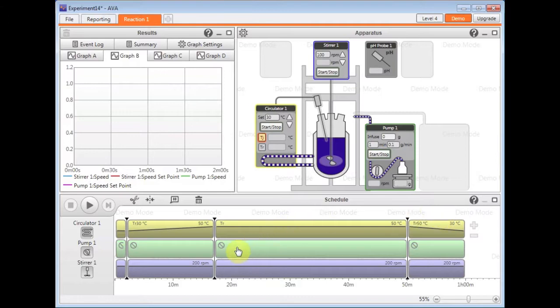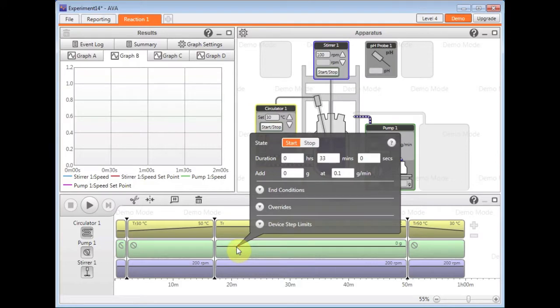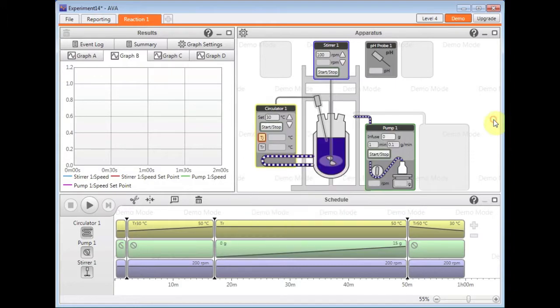If I click on the middle step here of the pump, I can then also set that to make an addition during that hold at 50 phase.